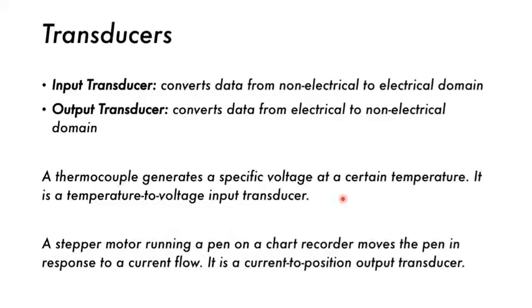And that's where transducers come in. Transducers are what are going to convert our data from the non-electrical to the electrical domain. So the input transducer converts data from non-electrical to electrical domains. The output transducer converts data from electrical to non-electrical domain.